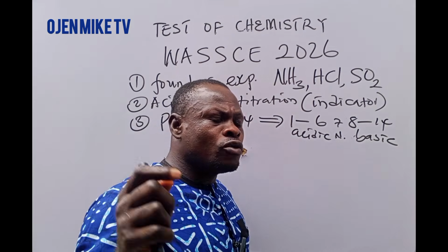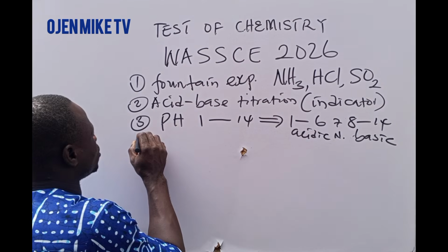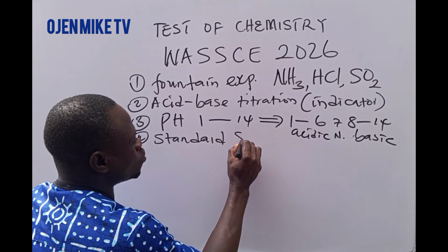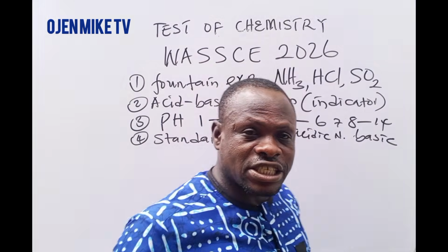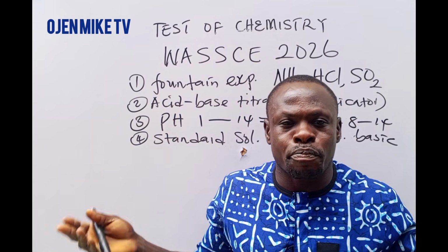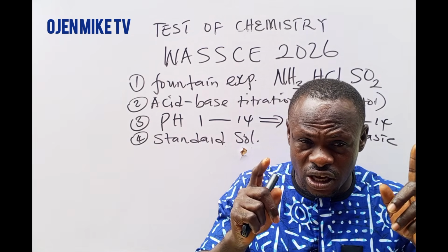Now the next one you should be preparing for is standard solution. What is a standard solution? A solution of known concentration is called a standard solution. How do you prepare your standard solution? Just take note of it.